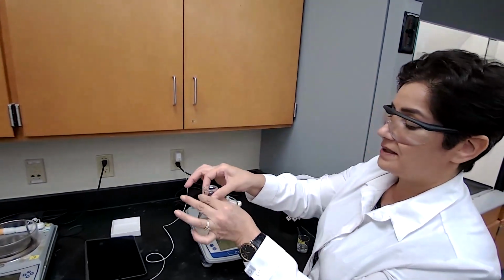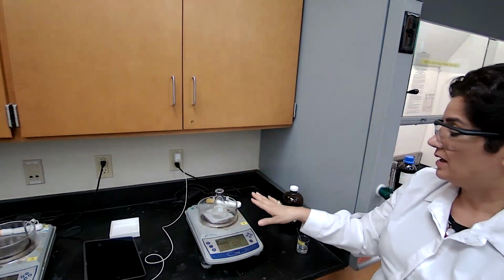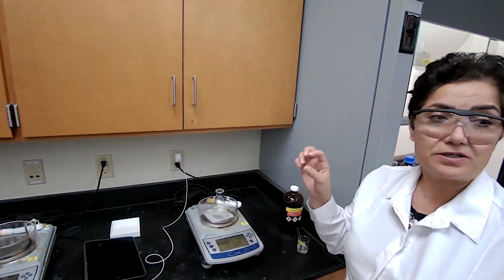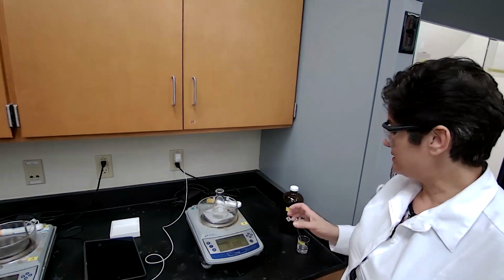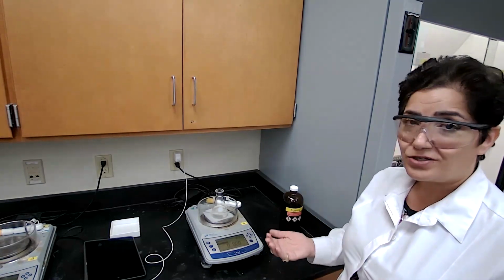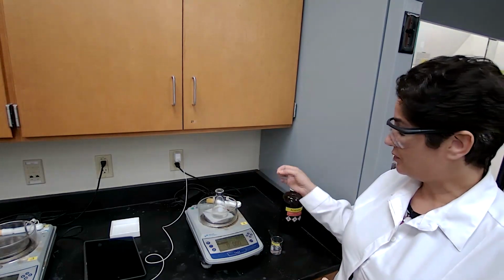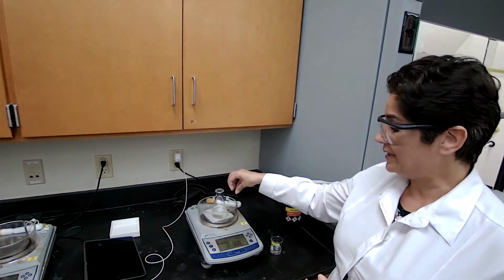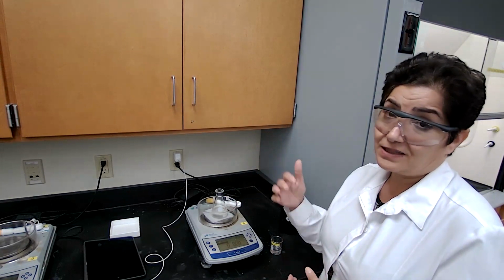So I'm going to place the mixture in the flask on the scale and press the tare. Well, I could have measured in a graduated cylinder and then added it. By the time I measure it, because of the low boiling point of acetone, most of it would evaporate. So to avoid evaporation of the acetone during measurement, I have a cold solution, and I'm going to add the acetone drop by drop into the cold solution until it reaches 1.218, which is given in the procedure.